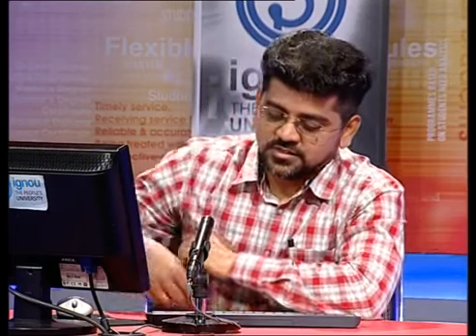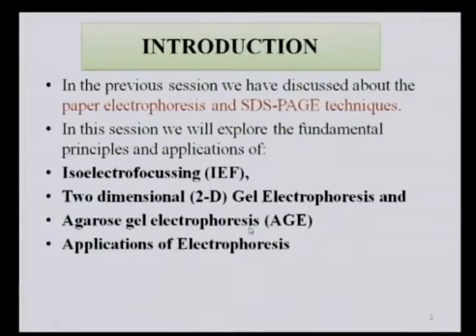In our previous sessions we have discussed the separation of proteins by using PAGE, SDS-PAGE and paper electrophoresis. Let us begin the session. In this session, we will explore more on the fundamental principles and applications of isoelectric focusing, two-dimensional electrophoresis and agarose gel electrophoresis. Along with that, we will be focusing on the applications of electrophoresis.